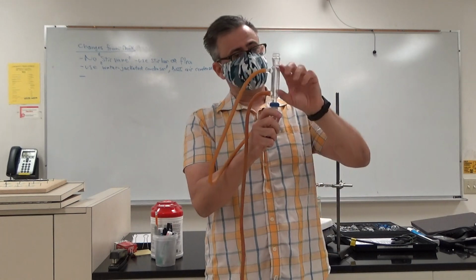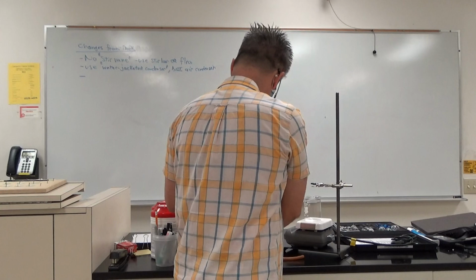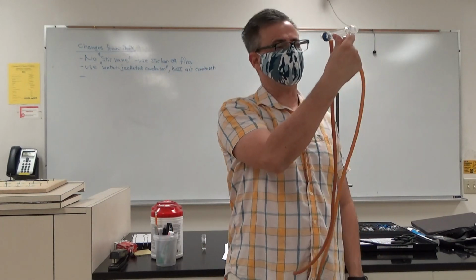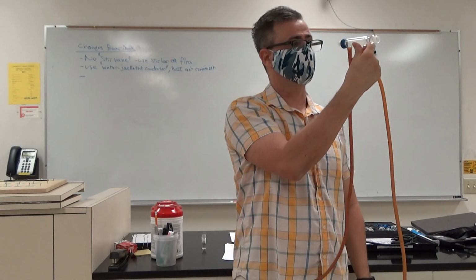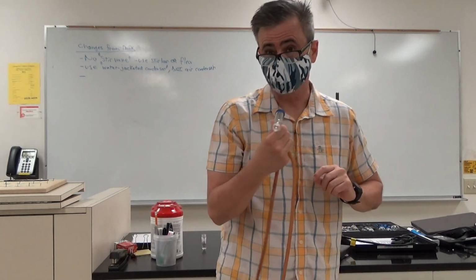And what's neat about these water jacketed condensers is that the jacket is separated from the interior of this, okay? So it will stay totally dry in here. A lot of excess water will actually wreck this reaction, okay?